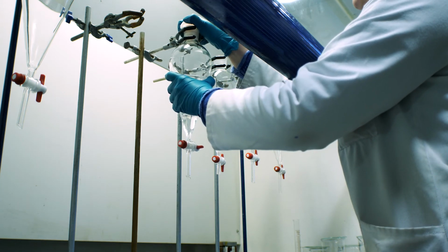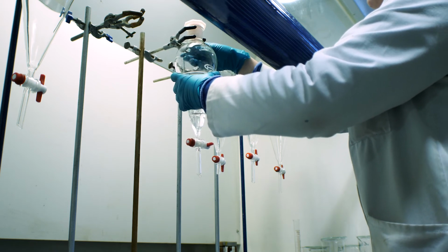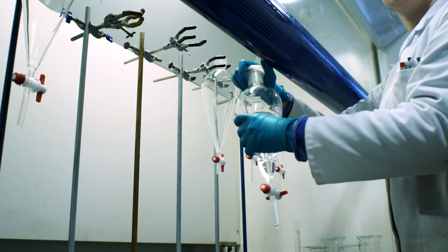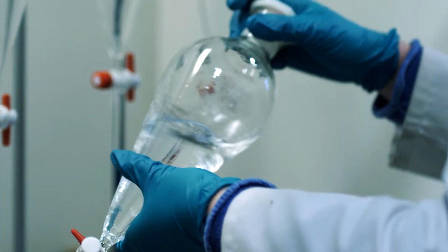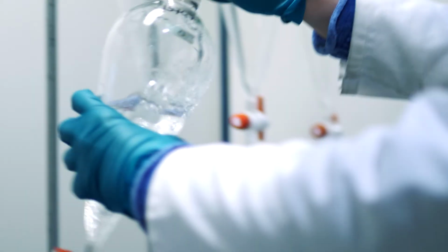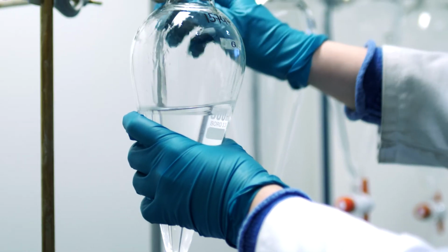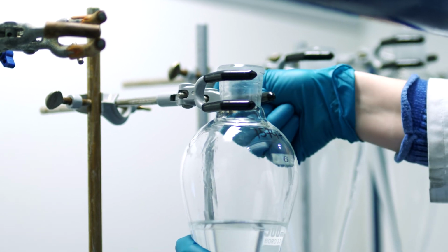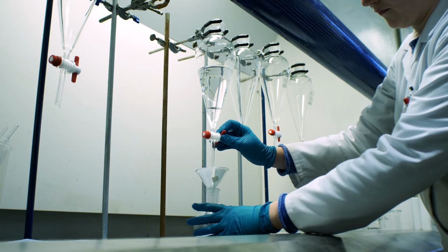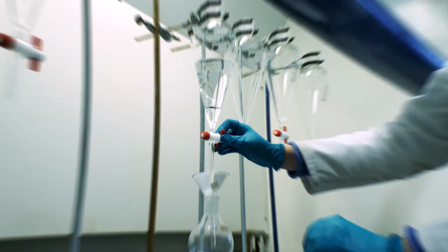The source of industrial contamination and pesticides is often more challenging to determine than other compounds. Therefore, a laboratory consultation may be needed to decide if the suspect contaminant is a herbicide, a fungicide, or an insecticide. If you suspect that increased agricultural or industrial activity in the region has caused the contamination, then this suite is recommended. A common source of water contamination from hydrocarbons would be home and industrial heating oil or diesel spillage. This suite also provides a test for this.